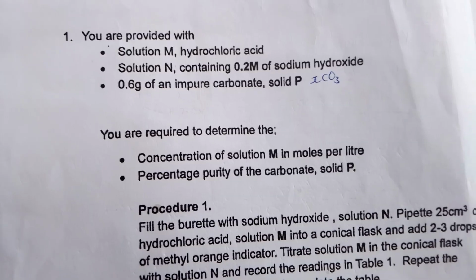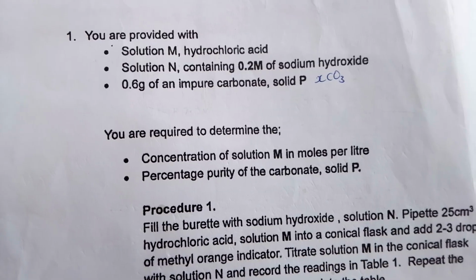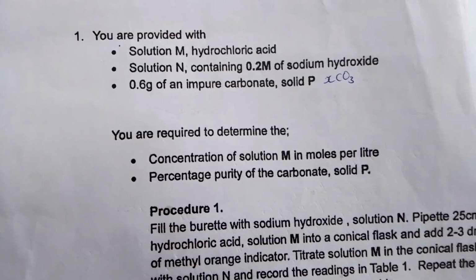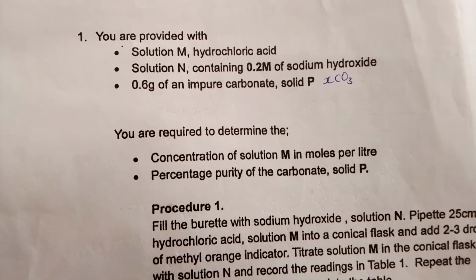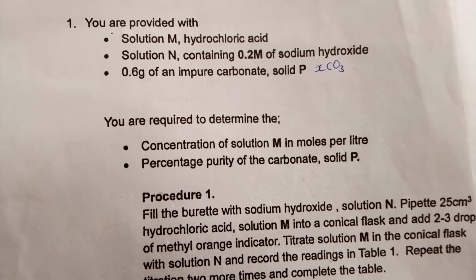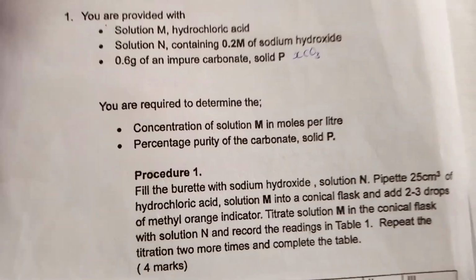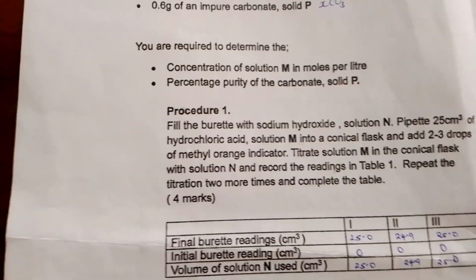You are provided with solution M, hydrochloric acid, and solution N containing 0.2 molar of sodium hydroxide, and also 0.6 gram of impure carbonate solid P. You are required to determine the concentration of solution M in moles per liter and the percentage purity of the carbonate solid P. So let me just take you through the procedure slowly as we go by.